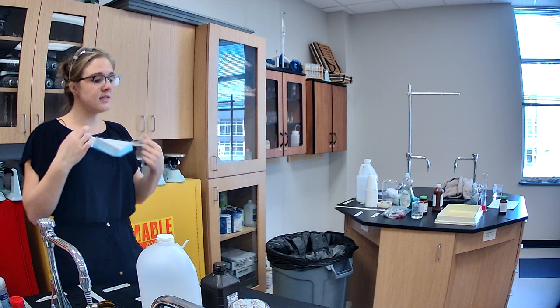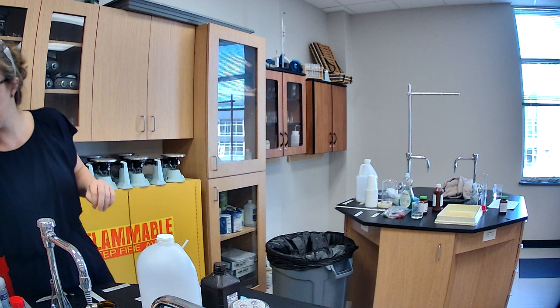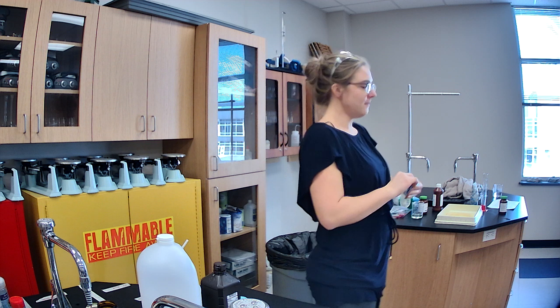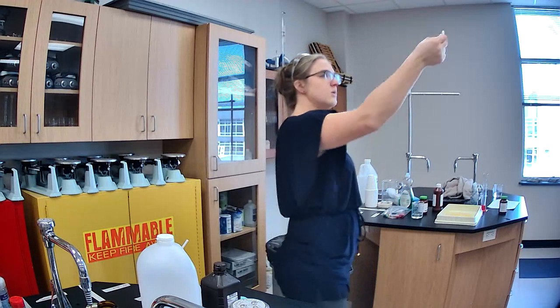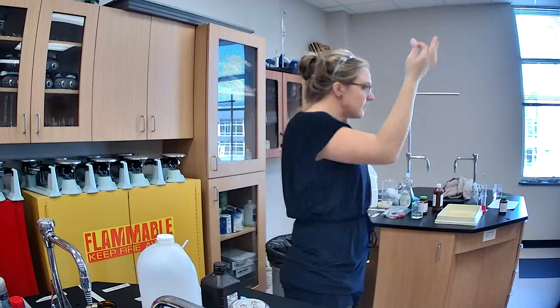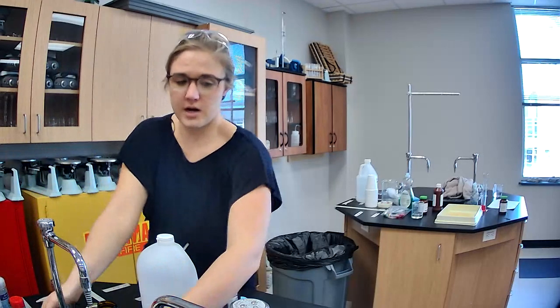Okay, great. All right. First thing we're going to do is the first experiment there with Alka-Seltzer and water in the Ziploc bag. However, instead of a Ziploc bag, we're going to use a beaker. I've told you about Alka-Seltzer a couple of times, but this is what it looks like. It's a little tablet, nothing crazy. And all we're going to do is fill this up with some water.